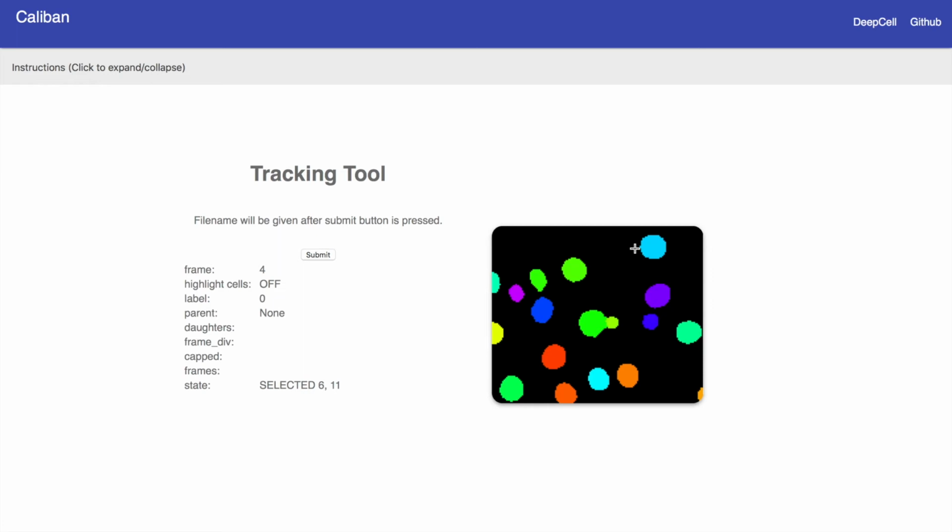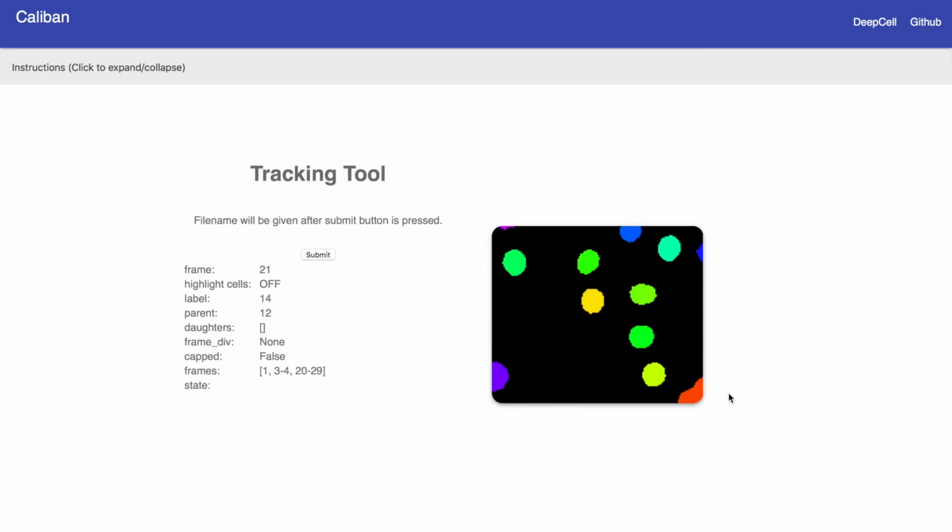Then, hit S to swap the cells. Lastly, we'll go through the watershed operation. This function is to separate one cell mask into two cell masks. Click on one pixel in a cell mask, then another pixel in the same cell mask. These points should correspond to the centers of the cells you are trying to separate. Then, press W to split the mask into two.